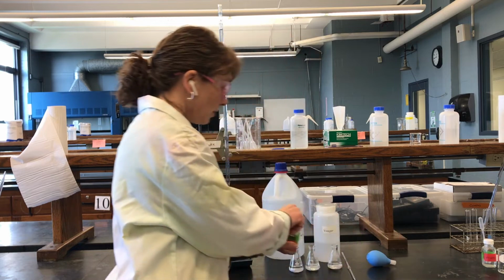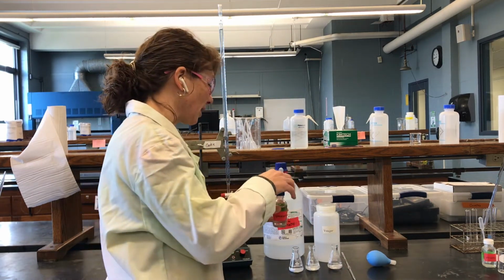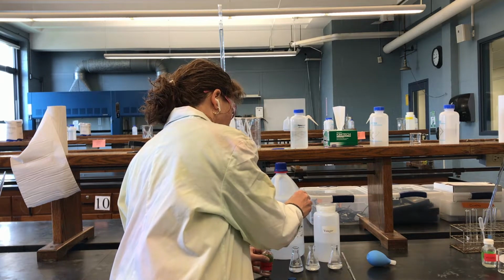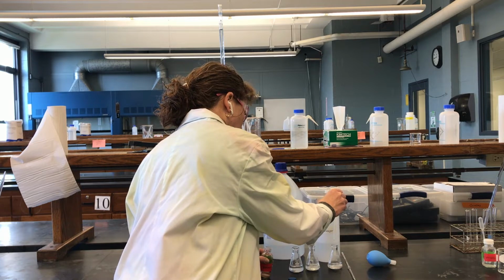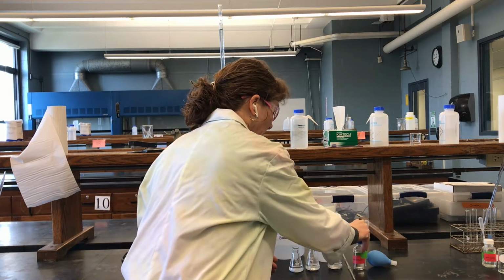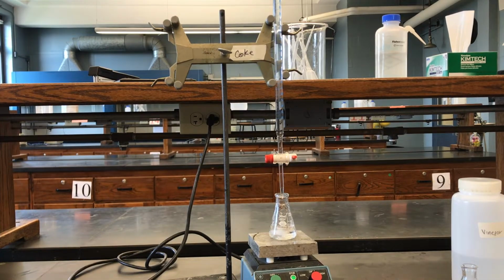And what I'm going to do now is I'm going to add the phenolphthalein, the thing with way too many consonants, our indicator solution. And I'm going to put in 3 to 5 drops in each flask. And remember, phenolphthalein is colorless in acid solution. It only turns pink in basic solution. So right now, even though I've added the phenolphthalein indicator solution, you can see that all 3 flasks still remain colorless. So now I have my first flask on the stir plate ready to go. I'm ready to perform this titration.